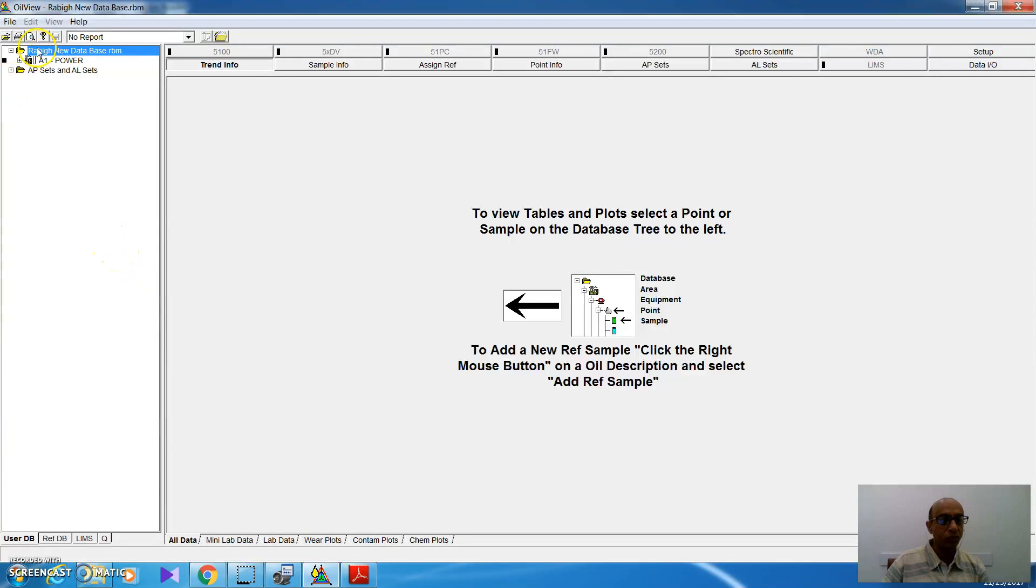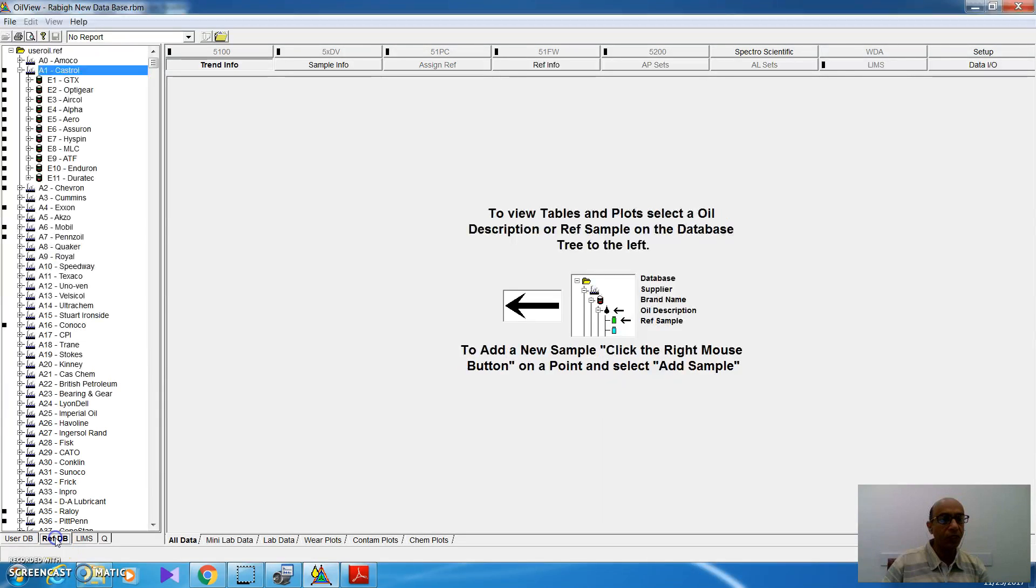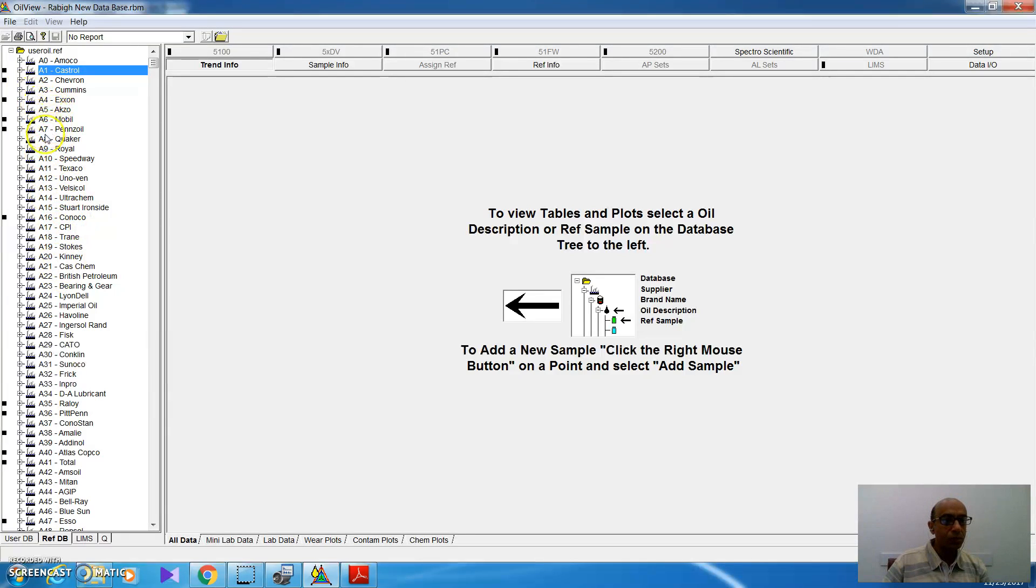I am here at the main database. To go to reference database, I have to go to this sub-menu, then click RefDB. From here, I have the ability to go to any reference oil and check it, see its parameters and have a look on it.